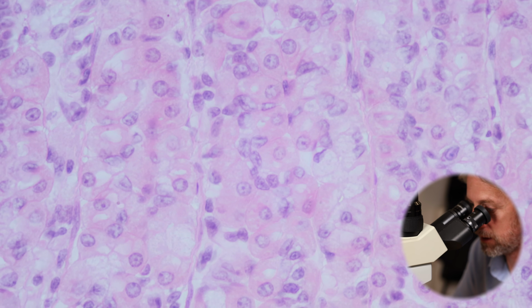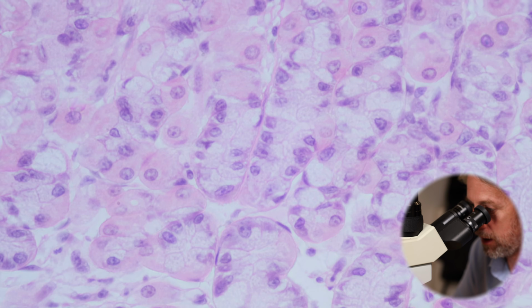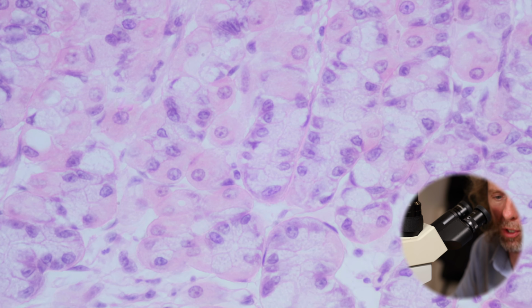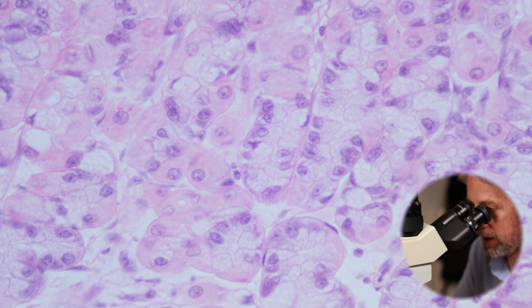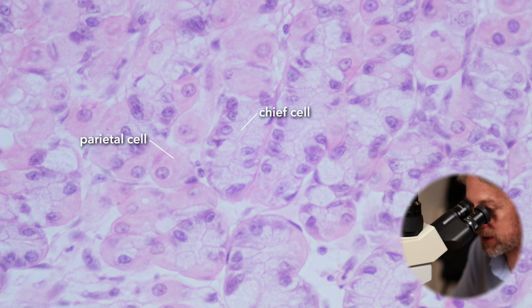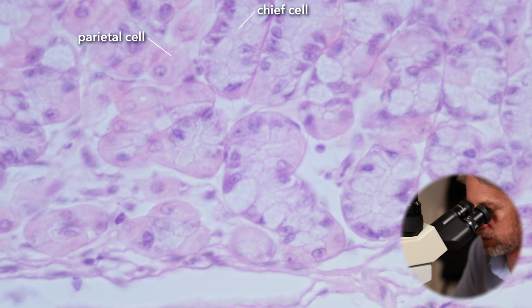And then the other cells, so if the stain had been left for longer, the chief cells might look a bit more purpley than this. I don't know how to describe it, but I think I've got them right in the middle there. Those chief cells, they're not pink, and they just kind of look glandy. They look really, really glandy. And in some sections there's a nice circular arrangement of chief cells, which are producing pepsinogen.